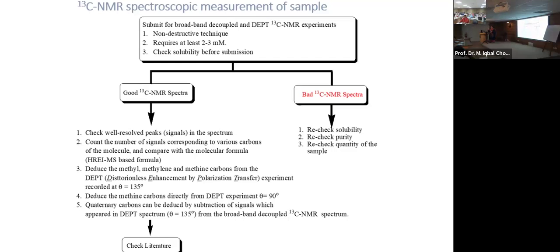In proton NMR, though all the information is there, it is often overlapped, even for a medium-sized molecule. This proton spectrum has all the information you require, but you need to decipher it. That is why 2D is required.